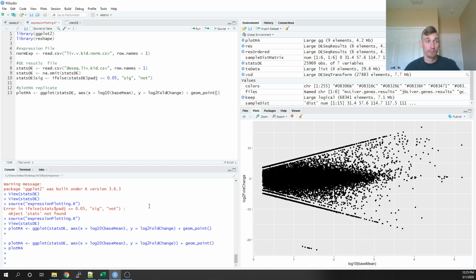All right. So we've seen all of this before. It's just I don't have colors associated with my p-value. But I added that nice little column, so I can go ahead and add my color variable. Let me just do that real quick.